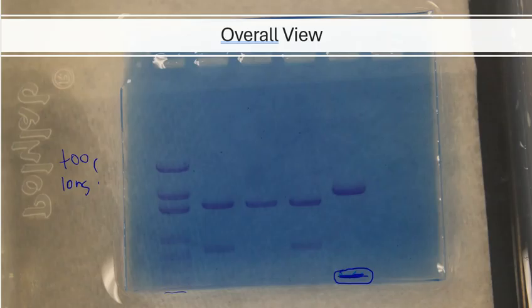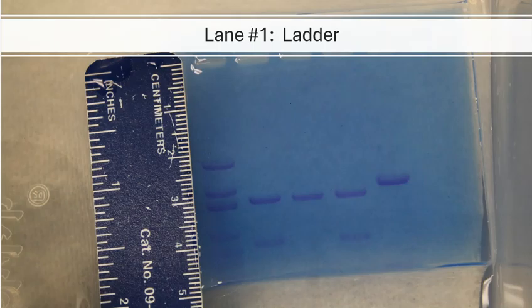And we need to go through and actually do some measurements now. So the very first one is the DNA ladder, and the ladder is made up of base pairs. That's why we run these ladders. They're all base pair driven, and it's an assortment of different base pairs. I will give you those base pairs in your laboratory worksheet. You will see numbers there with the base pairs, and those numbers have been provided, and you will need to do something with those numbers.